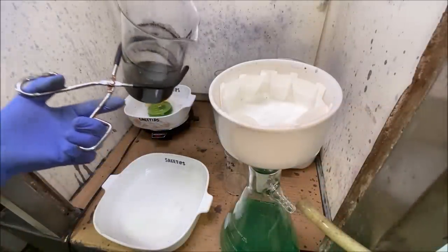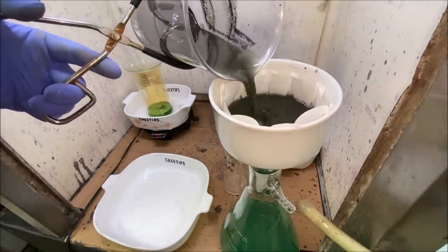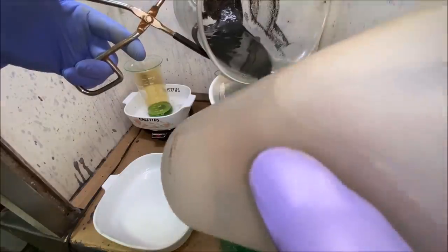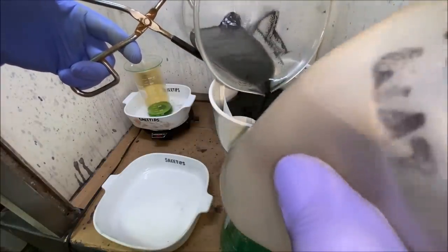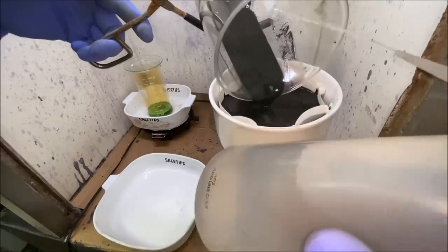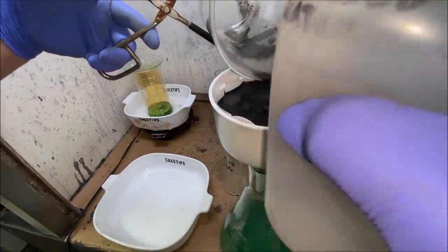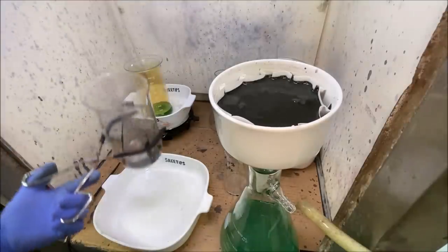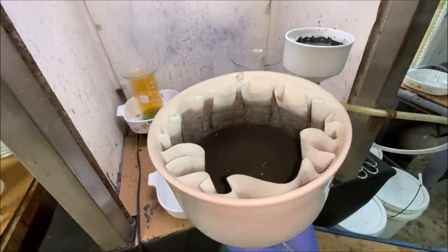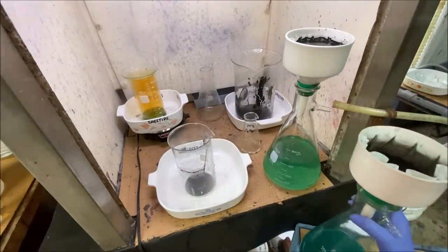I'm going to continue filtering off the liquid from this solid material that's been treated with Piranha solution. Here's the funnel that took hours and hours to pull all the liquid through. Now this should be kind of neat.